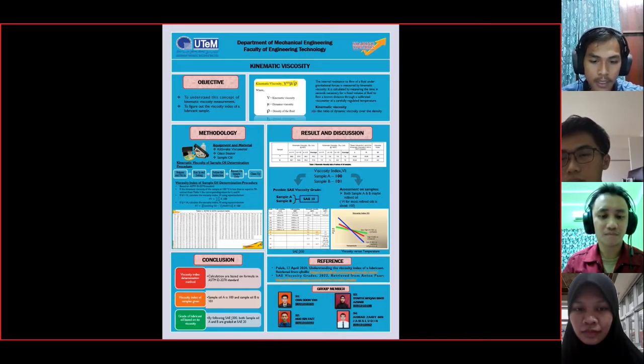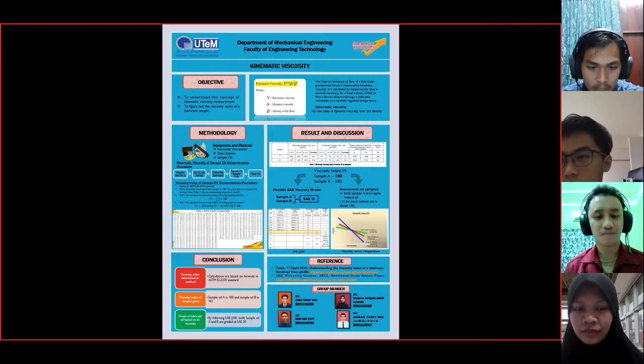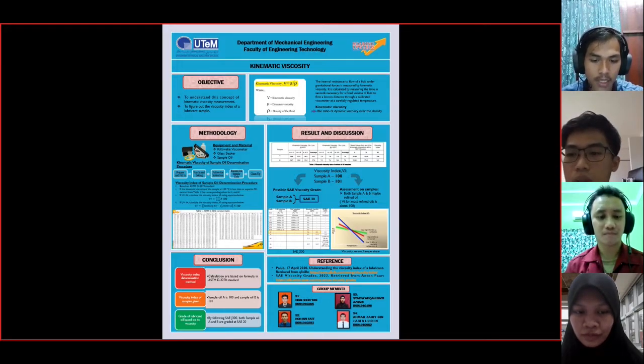Number two, the viscosity index of the samples for this case study: sample oil A is 100 and sample oil B is 101. Number three, the grade of lubricant oil based on the viscosity index for sample oil A and B. By following SAE J300, both sample oil A and B are graded at SAE 20.